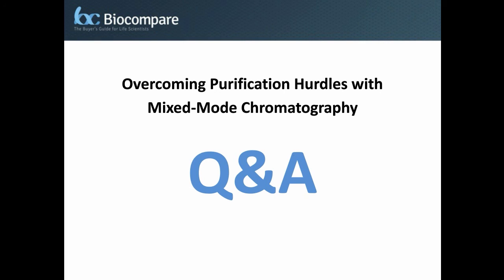Okay, and I've got another question here. It's similar to the previous one: how does this resin compare to other mixed mode resins? Maybe some thoughts you can share? Well, again, your protein might flow through one mixed mode and bind very tightly to another one. And let's assume for the moment that they're both hydrophobic cation exchange type resins. So there's no way of predicting. You just have to try it. I hesitate to directly compare the results that our customers have given us head-to-head with other resins because I don't believe that's a fair thing to do because somebody else can get exactly the opposite result. So I think I'm just going to leave it at that.